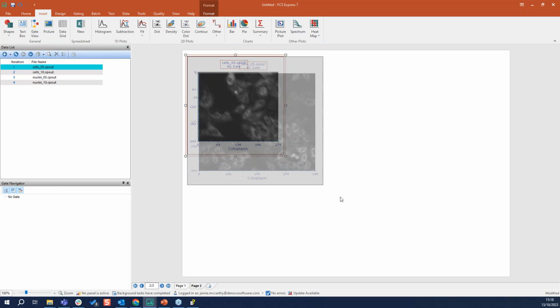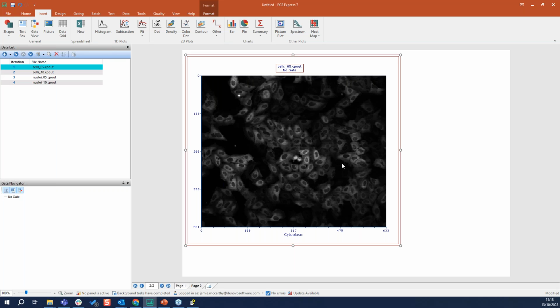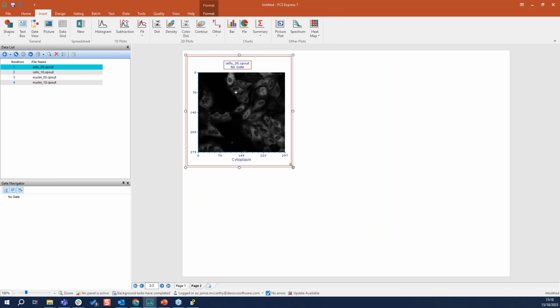You can tell that because if I resize this to be bigger, I've kept this image size, but I've just exposed a little bit more of it. Now, you may want to actually have the image zoomed out a little bit and show it all in this kind of size here, and you can do that. And this is a little bit of a theme that's going to be coming up today.